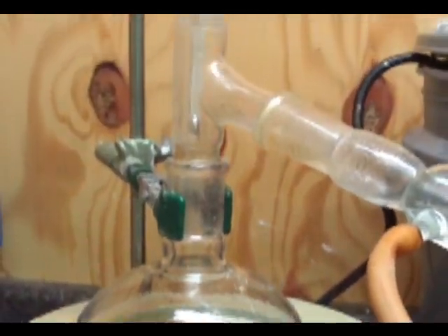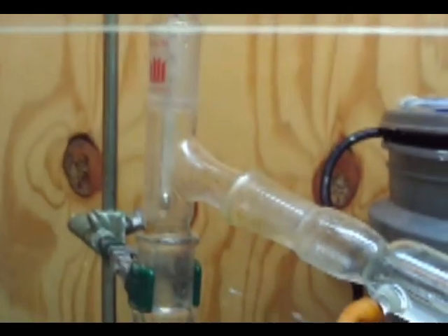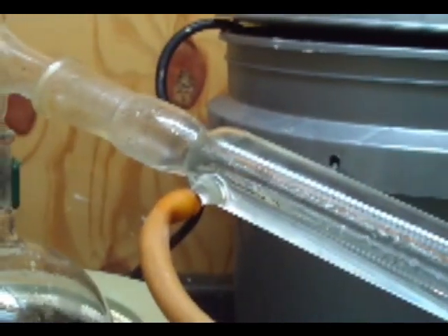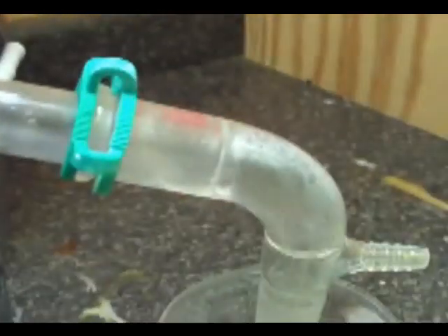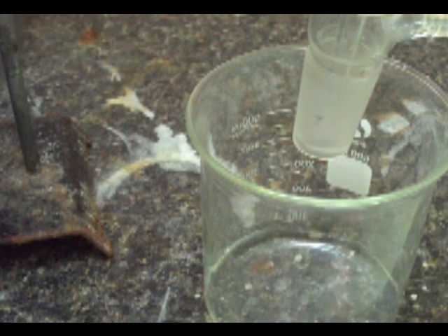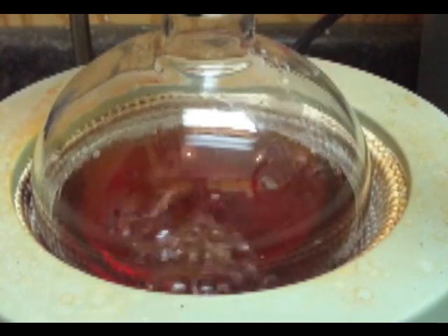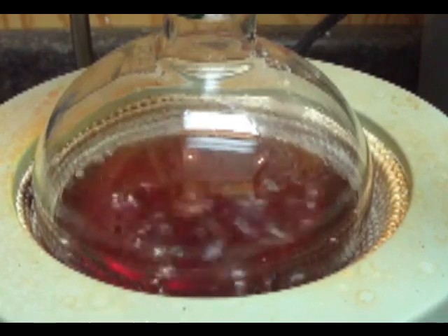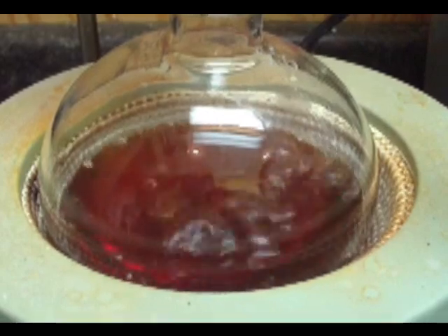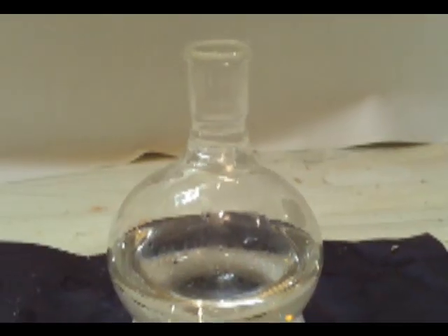I think I distilled this for about three hours, and it took about an hour and a half to get all the water out. After the water is out you'll see your temperature rise from 100 degrees C up — it'll start moving up higher. You'll want to start collecting what comes over at about 126 to 127 degrees. We're at 127 now and you'll notice it changed to a kind of blood red color. This is the first distillation. Later, I distilled it a second time and got about half of what you're seeing.